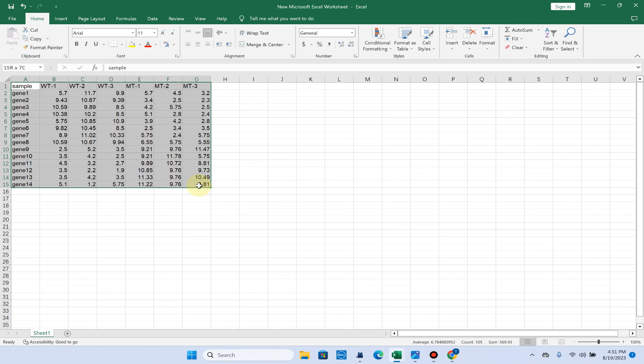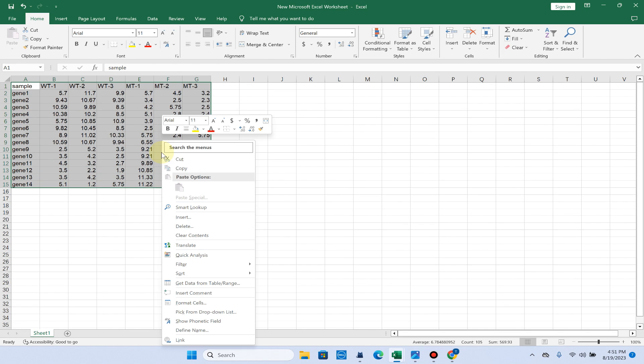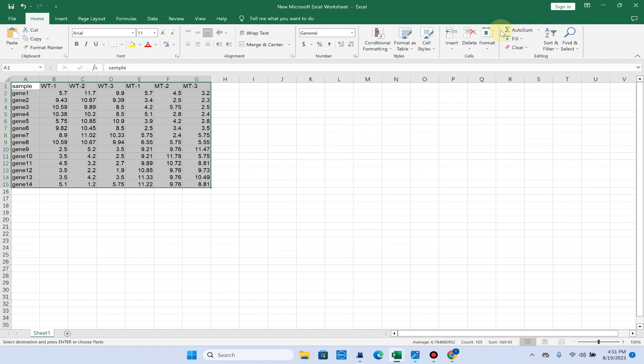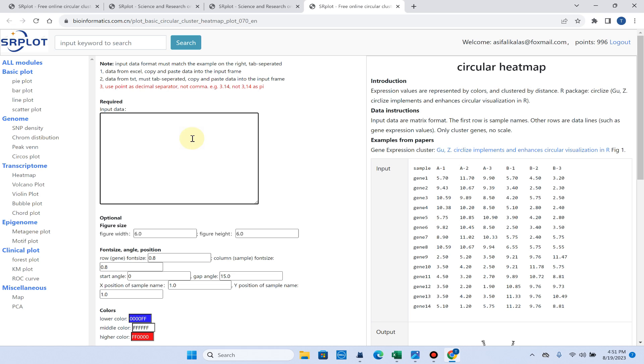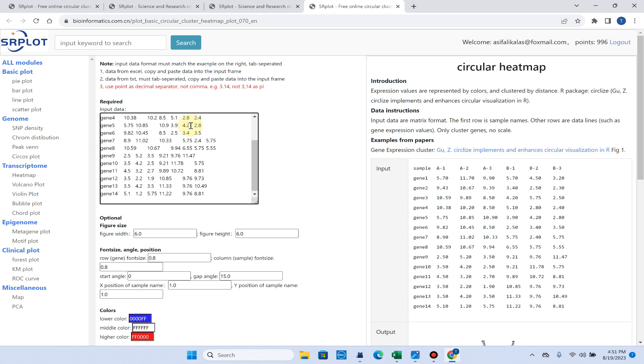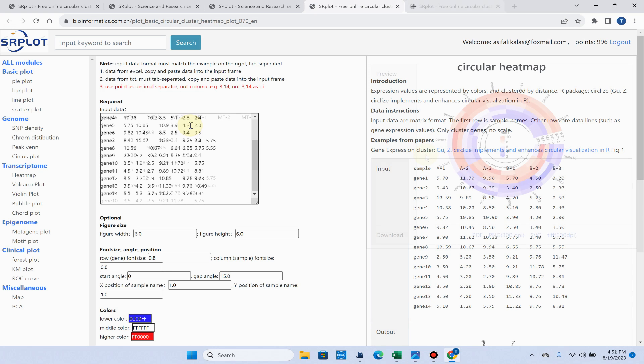You can simply copy all these expression values or fold changes values and directly paste them in this input data box.